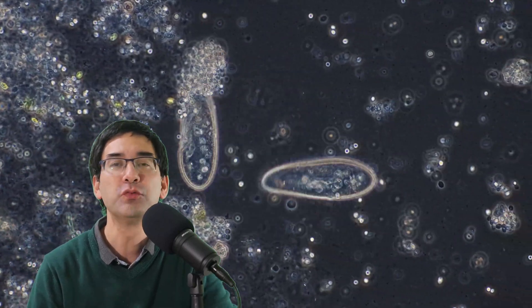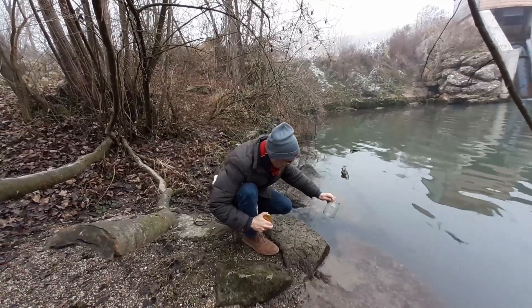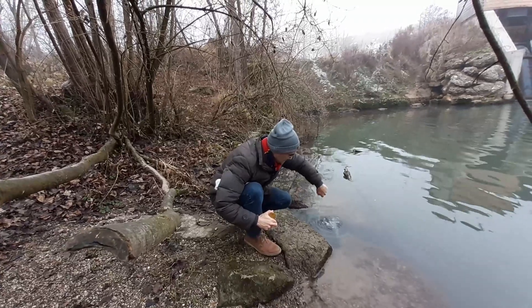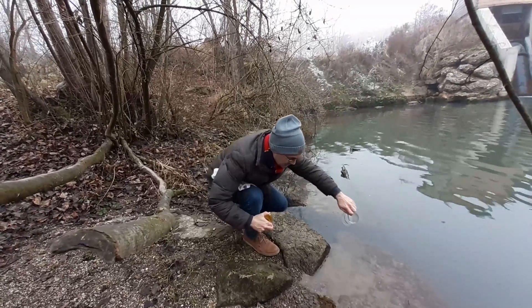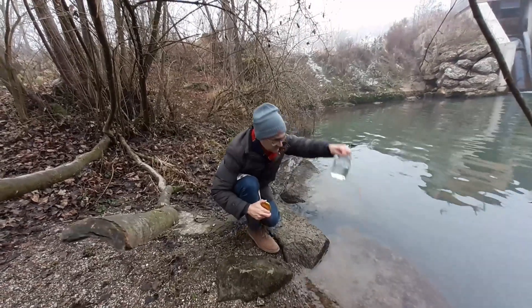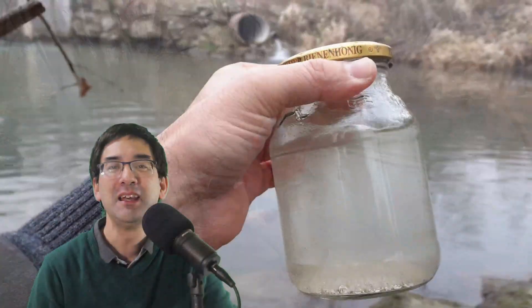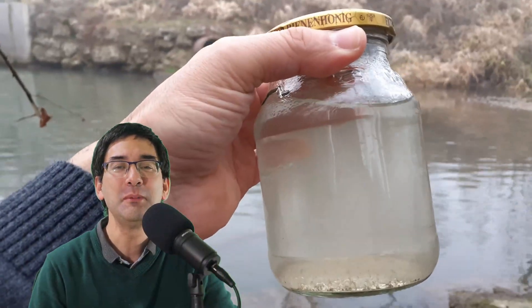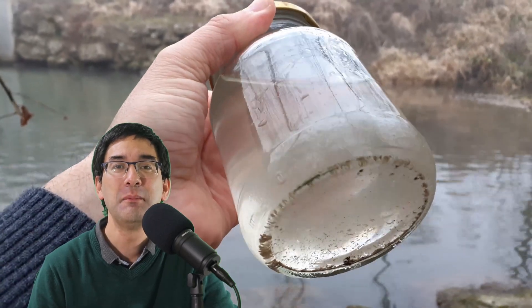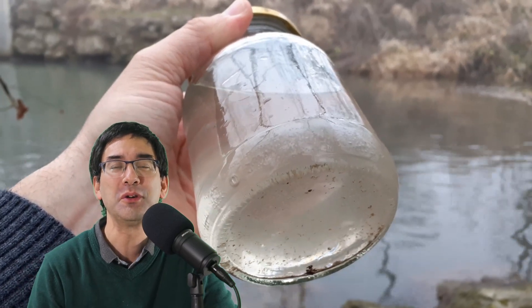There can be a variety of reasons for this. During winter time there are generally not so many water organisms in a pond or in a lake, or you might simply have too low a concentration of microorganisms in a water sample, and therefore the water sample might look a little bit boring and uninteresting. Luckily, it is quite easily possible to culture paramecia — these are single-celled microorganisms and it's quite easy to culture them.